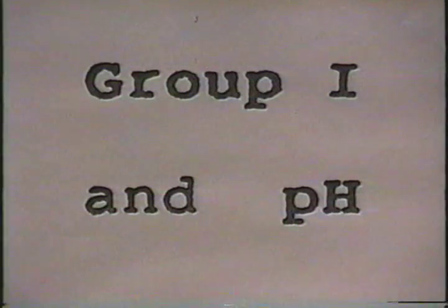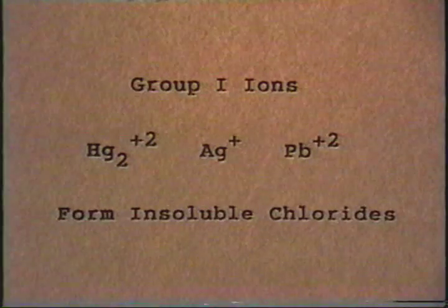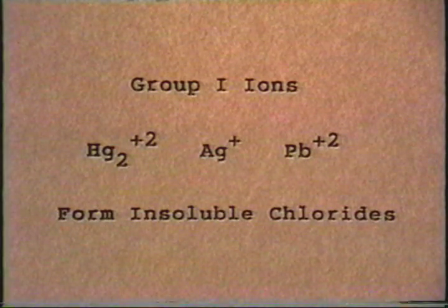Well, today's really your lucky day. You get to play a double header. Two completely different experiments all the same day. We'll start with the qualitative analysis for the group 1 ions.